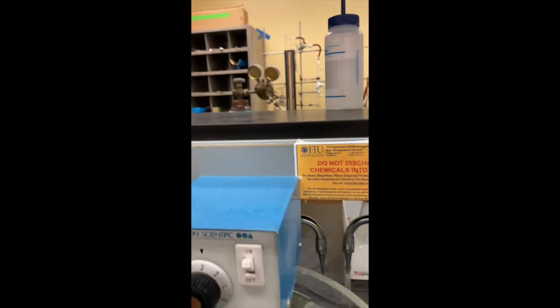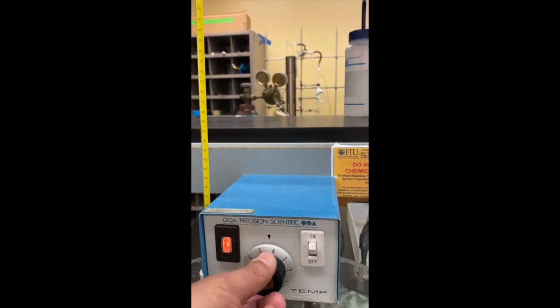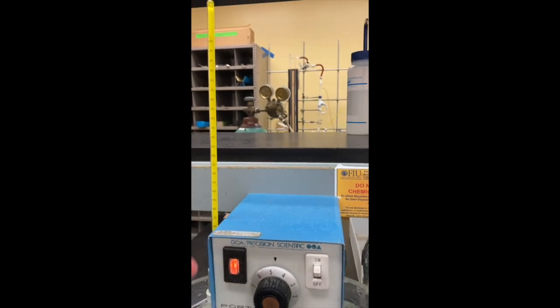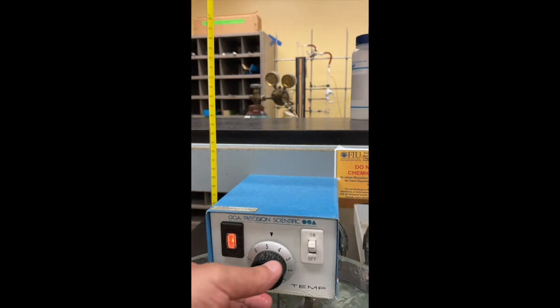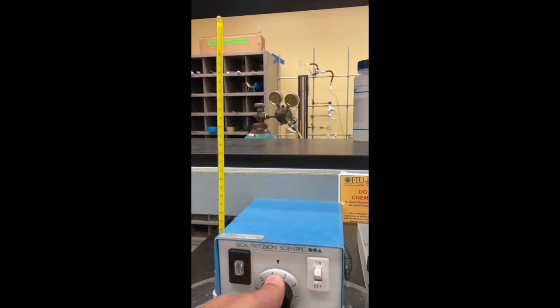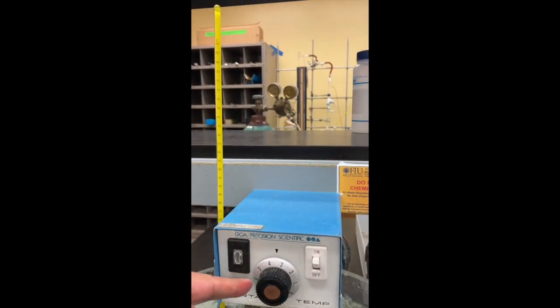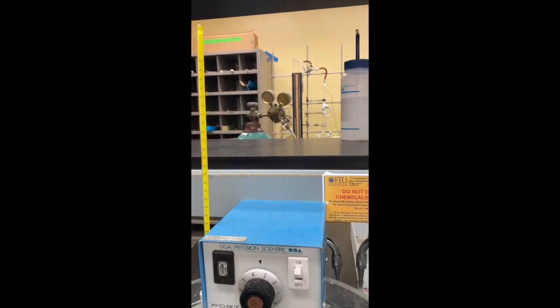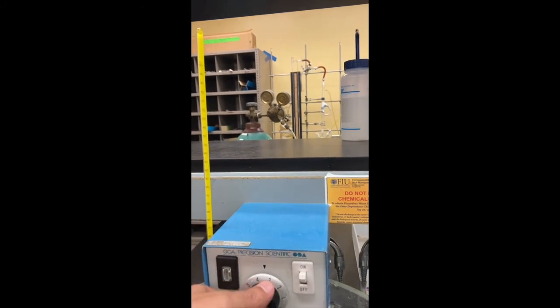So, how do we control the temperature? You can see if we adjust this knob, the light goes on, it means heating continues. Heating is switched on. But if you adjust the knob, you can switch off the heating, and in such a way you can adjust the temperature. Of course, if you overheat this water bath by too much, you can bring some ice from the stockroom and put some ice in to reduce the temperature.